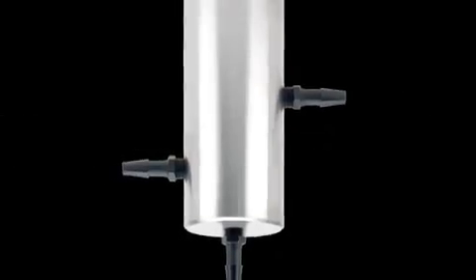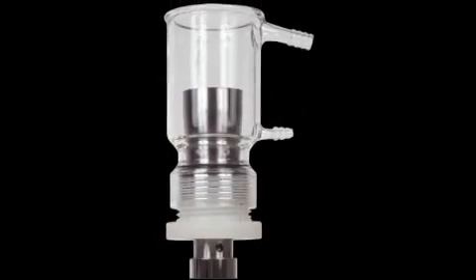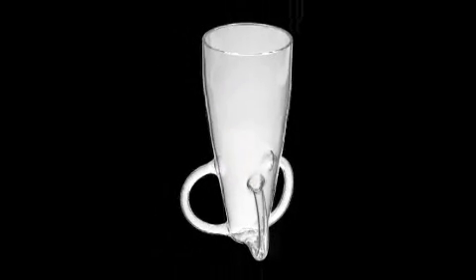Sonics manufactures a wide range of accessories for both large and small volume applications, such as micro tips and probes, flow cells and cup horns, sonochemistry equipment, and glassware.